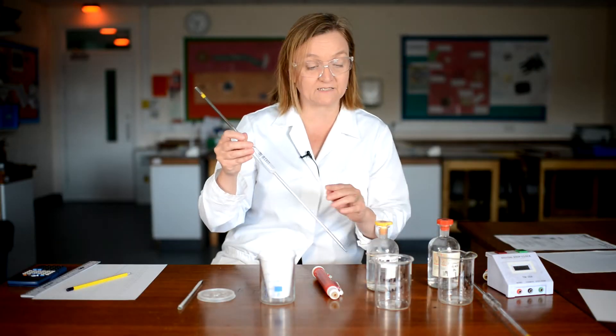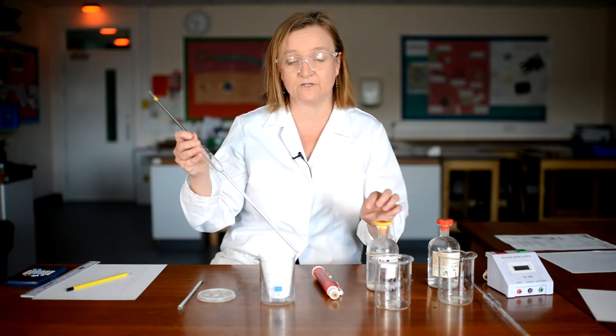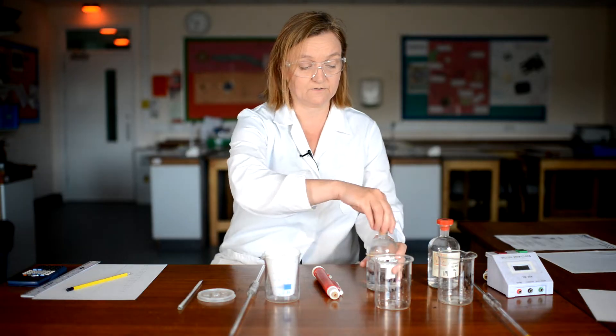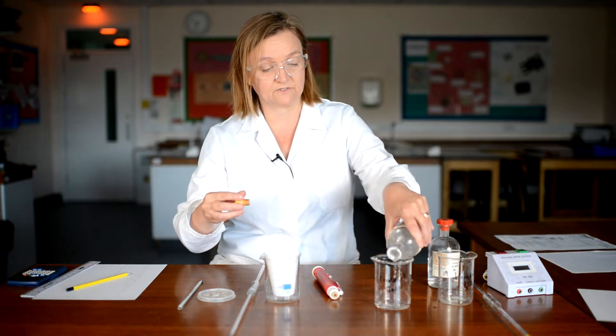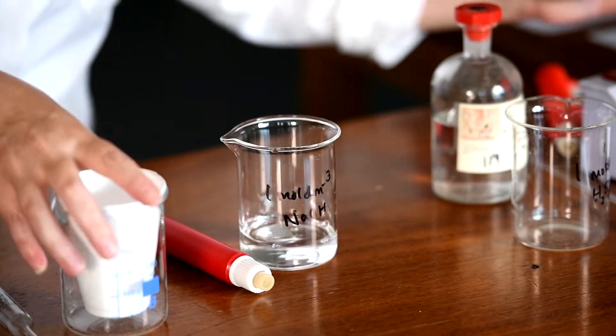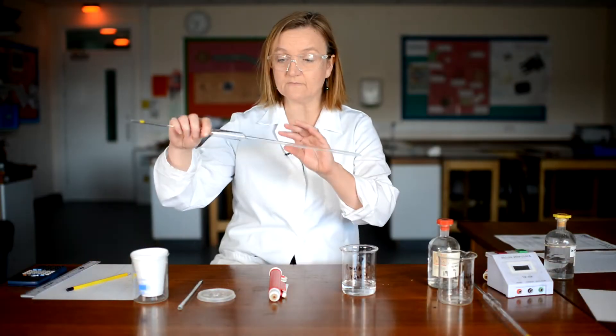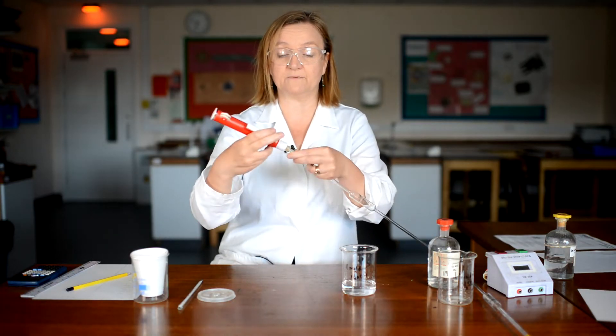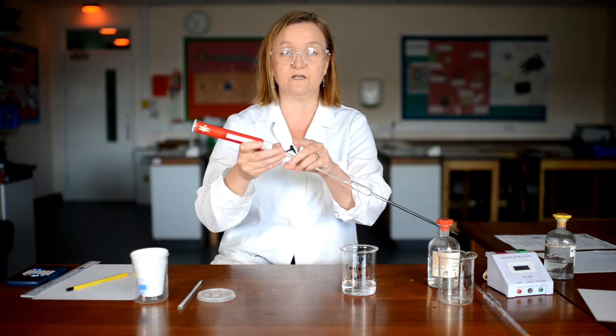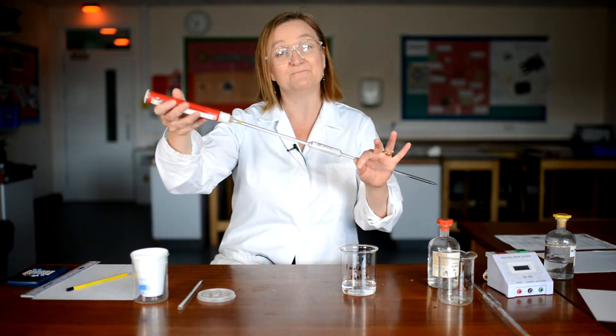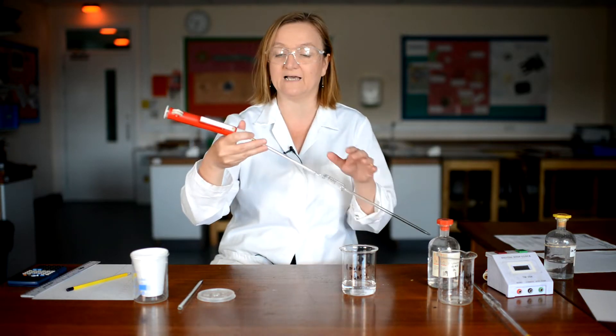So I'm going to use a 20 ml pipette here and so I've got the right number of moles of hydroxide ions. I'm going to take two measurements with my pipette so I'll have 40 centimetres cubed of my sodium hydroxide in my cup. So starting by just putting some of my solution into a beaker so that I can then safely use my pipette. I'm of course going to use a safety filler which I'm going to push very gently onto the end. I'm not holding it down here, you'll remember we don't hold a pipette down there because you might break it and it'll end up in your hand.